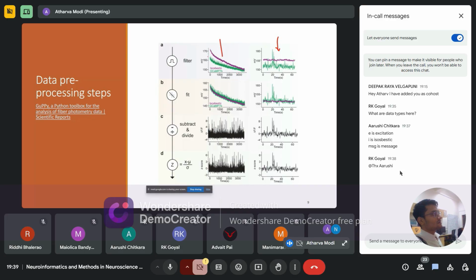The signal decays in time. This decay is due to a property called bleaching. Bleaching is a property of fluorescent indicators, any fluorescent material actually in biology, where the light can cause chemical changes in the fluorescent material and render it permanently disabled. So it does not fluoresce after that, as it is permanently inactivated.